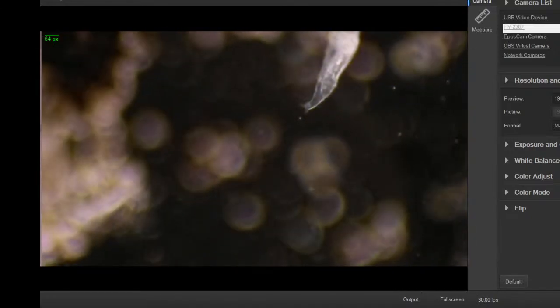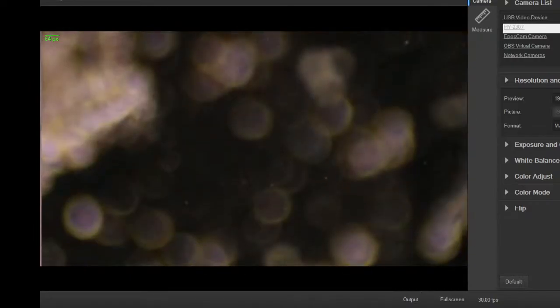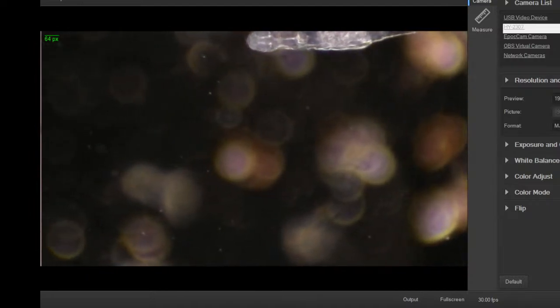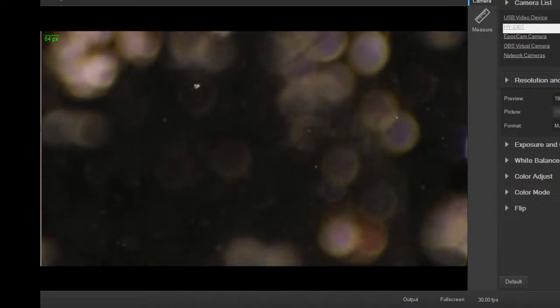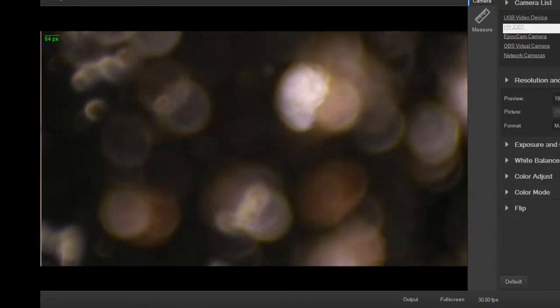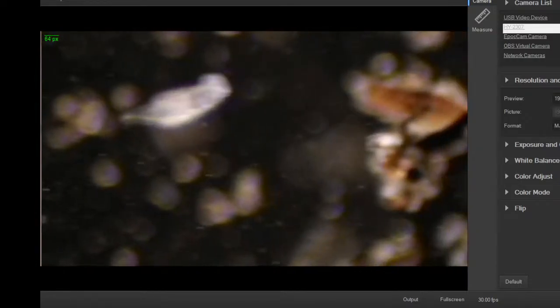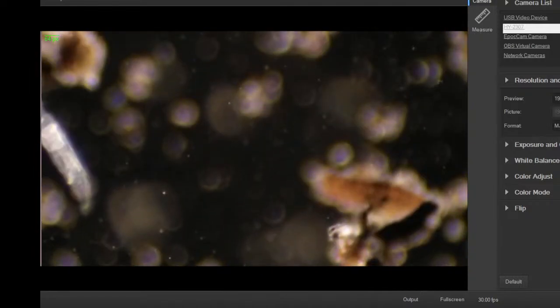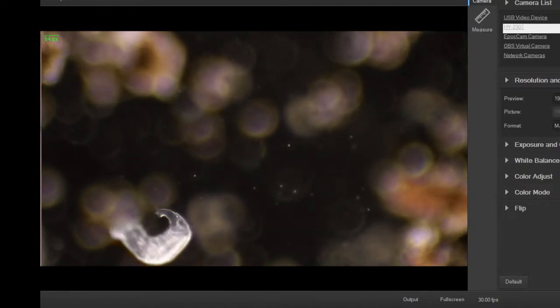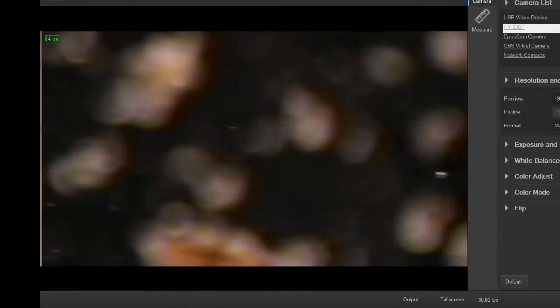Nice. See how much depth there is too. Look at that. I'm in focus of this guy, and the other guy's way in the background out of focus. There's a lot of damn water in the slide. Come on, do your little inchworm. You gonna do the inchworm? Now he's got the foot attached. Detaches the foot, swims, goes from place to place. And then does a little pivot on the foot, deciding where to go, and then can detach at will.